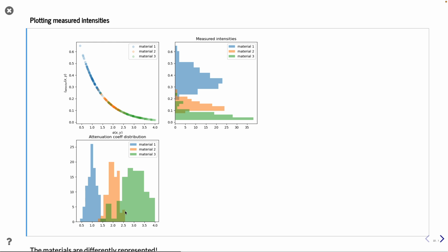And that is a problem when you start looking into the sensitivity analysis of your measurement. So typically, you want to be up in the upper part here, then you have good data. For tomography, the recommendation is usually that you have at least 20% transmission, otherwise you come into the more uncertain region.